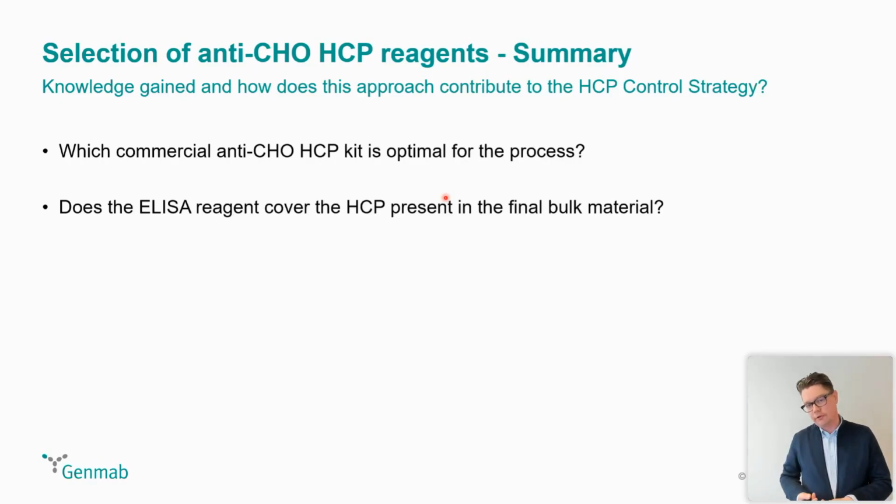Second of all, what we also realized was, does it actually detect what we know is present in our final material? It's fine if you have a high coverage number, but if it doesn't really detect the HCPs that are present in your product, is it then relevant?